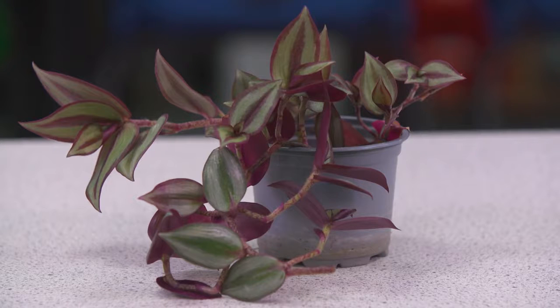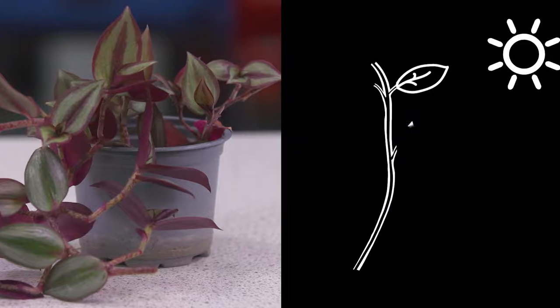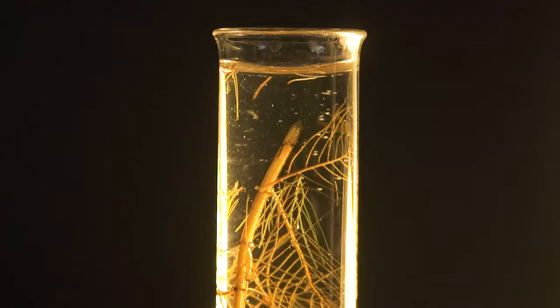So why does pondweed bubble? This is a classic photosynthesis practical, but it is somewhat counterintuitive. Often students learn about photosynthesis in a terrestrial plant where gas exchange happens via stomata into the air. And here we are looking at it in an upturned aquatic plant, which is releasing bubbles of gas from its stem. It can help to think about what is happening here in terms of the challenges that aquatic plants need to overcome, both in terms of the light available for photosynthesis and oxygen available for respiration.